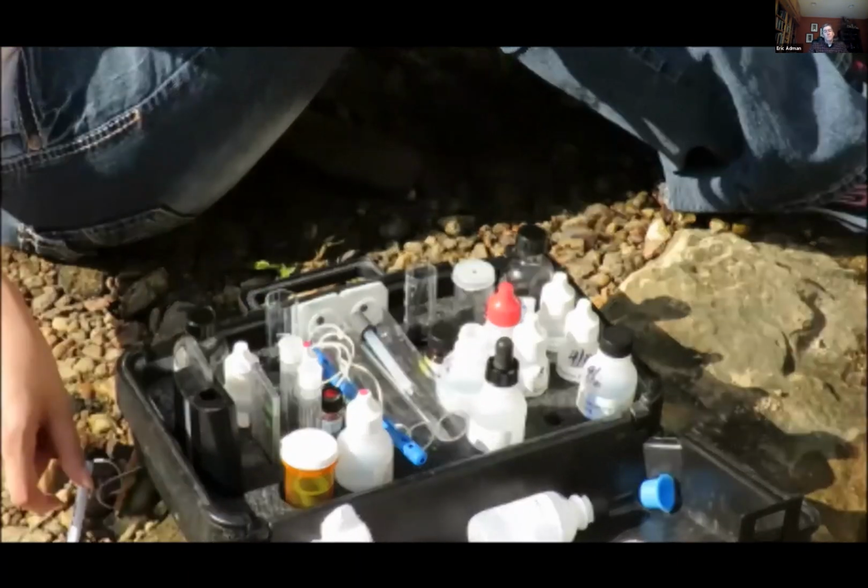Multiply the number of drops added by 5 to calculate a total alkalinity value in milligrams per liter.